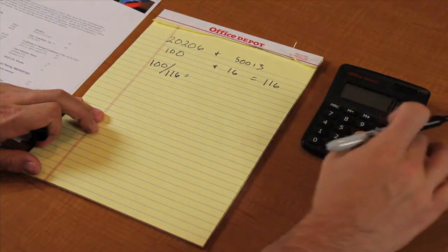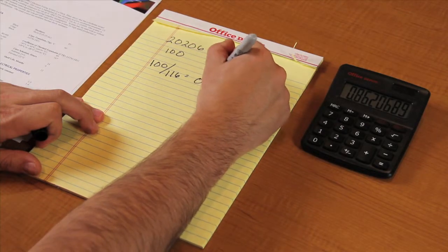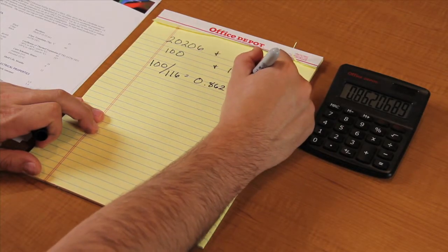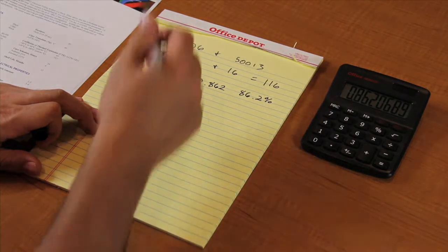To calculate how much material to add, let's convert this number to a percentage of the whole. The 20206 is 100 out of 116 total units. That gives us a percentage of 86.2%.